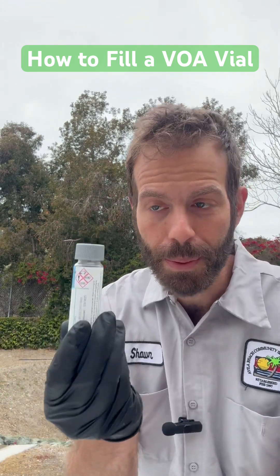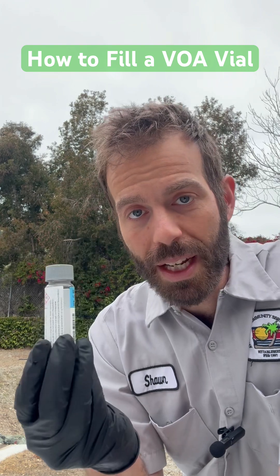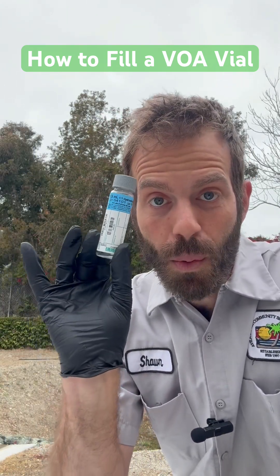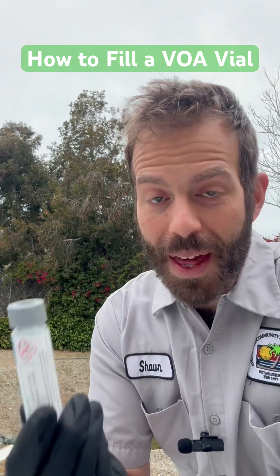You're going to have a reverse meniscus on the top when you place the cap on it. The purpose of that is to make sure that the stuff you're testing for doesn't volatize or disperse into the air. You want it all in the water because you're testing for volatile stuff. So that's game number one.